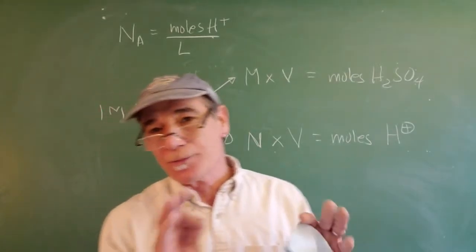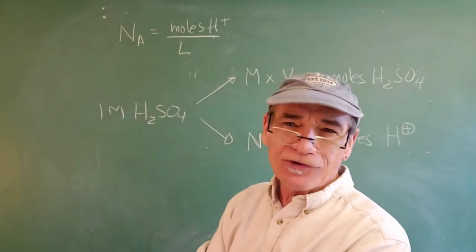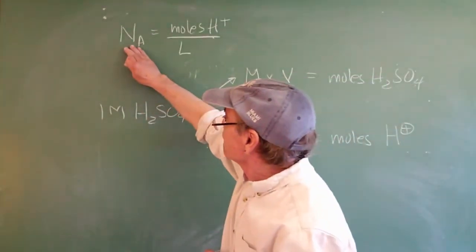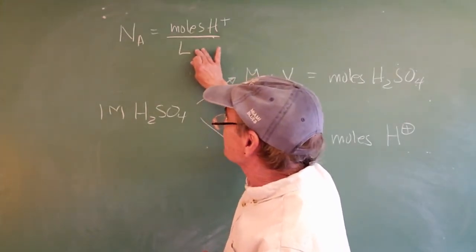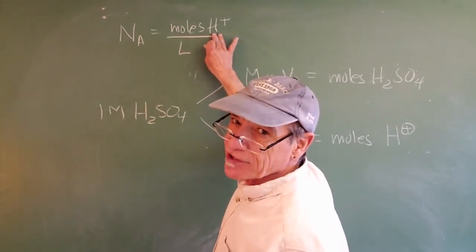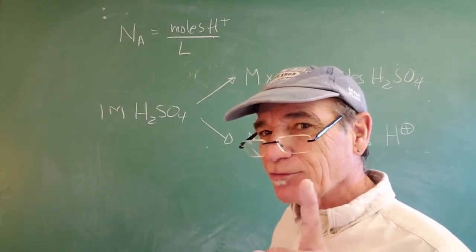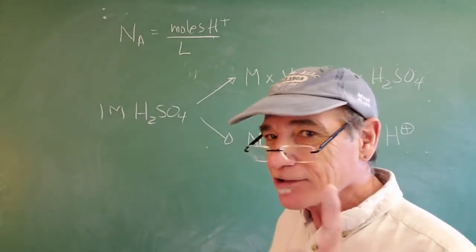Okay, just a little reminiscence here. Back when we did our acid-base titrations earlier in the semester, we introduced this concept of normality, which is a little subtly different than molarity. For instance, normality is defined as the number of moles of H plus a solution has in it per liter. Now remember that some acids bring maybe 1 hydrogen to the dance for each molecule. Some of them have 2, like sulfuric acid, H2SO4. Some have 3, like H3PO4. So 1 mole of an acid doesn't necessarily reflect its true acidity. You have to also incorporate how many hydrogens that 1 mole is bringing per molecule?